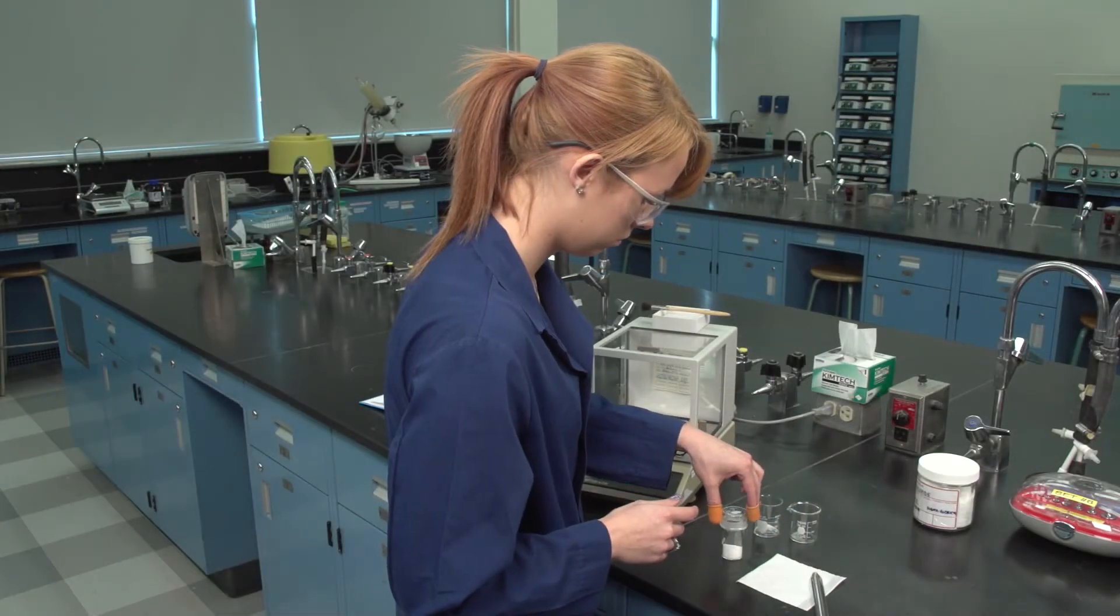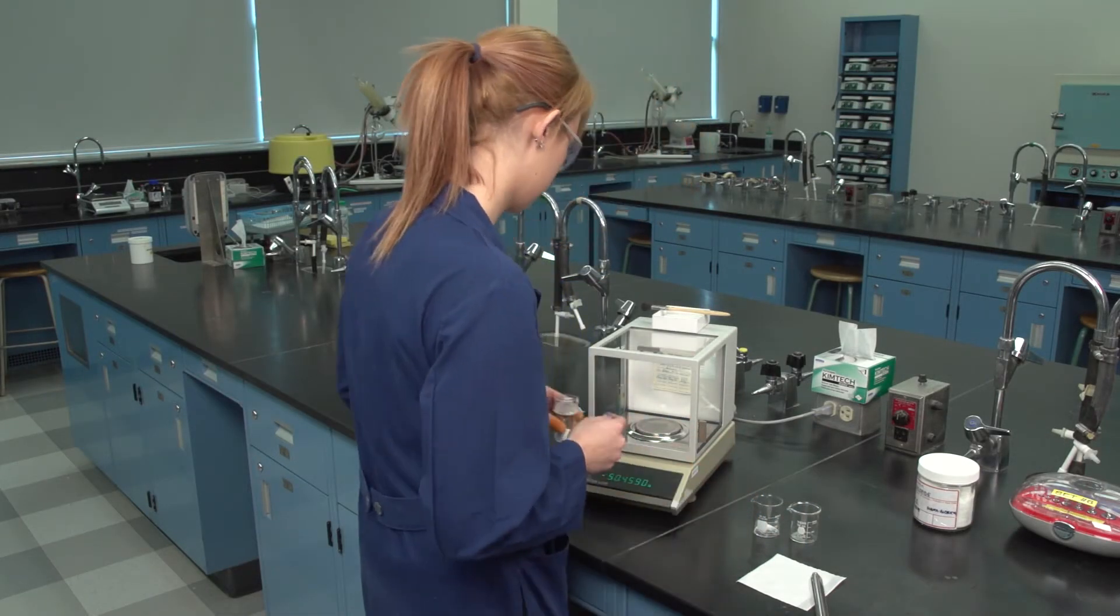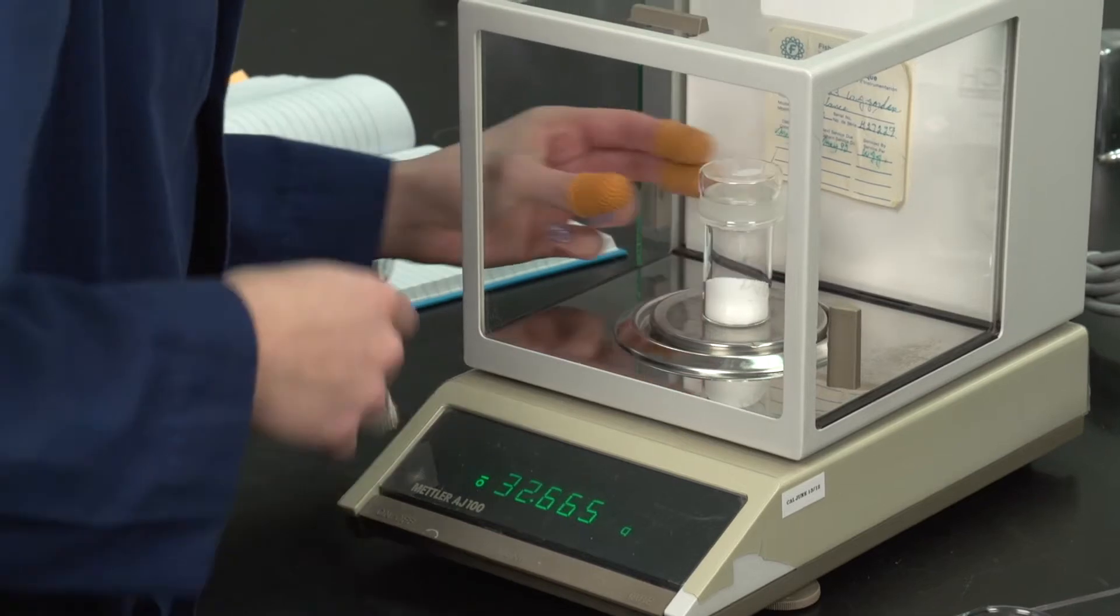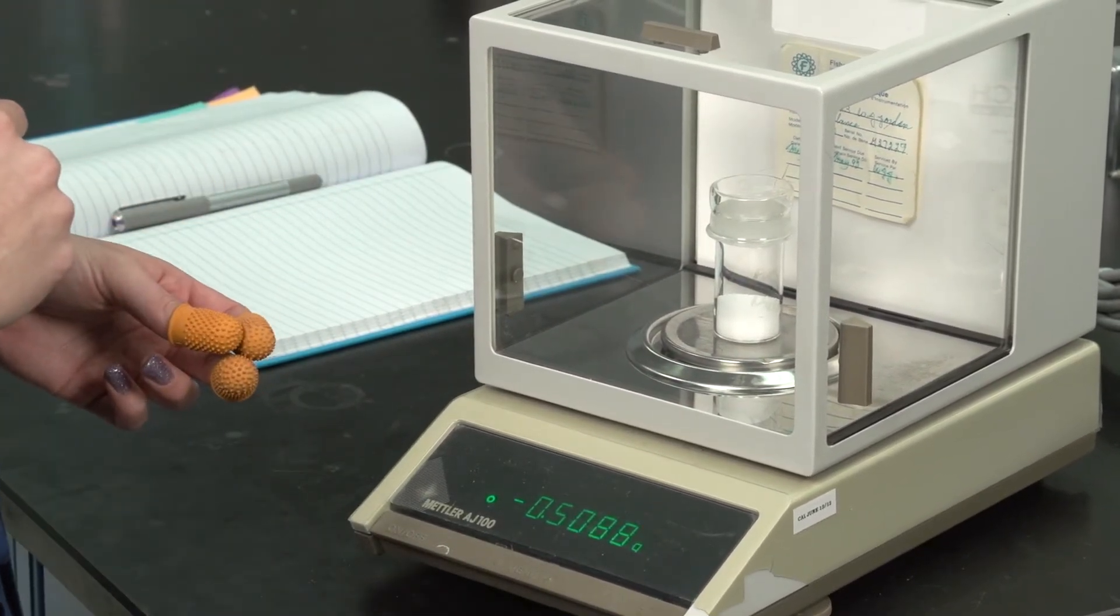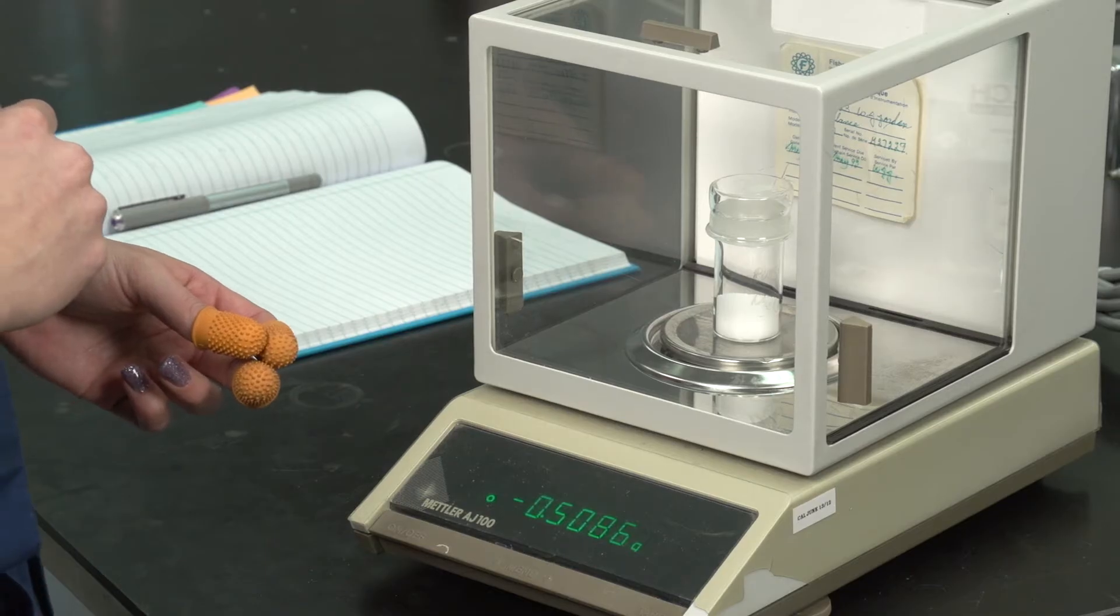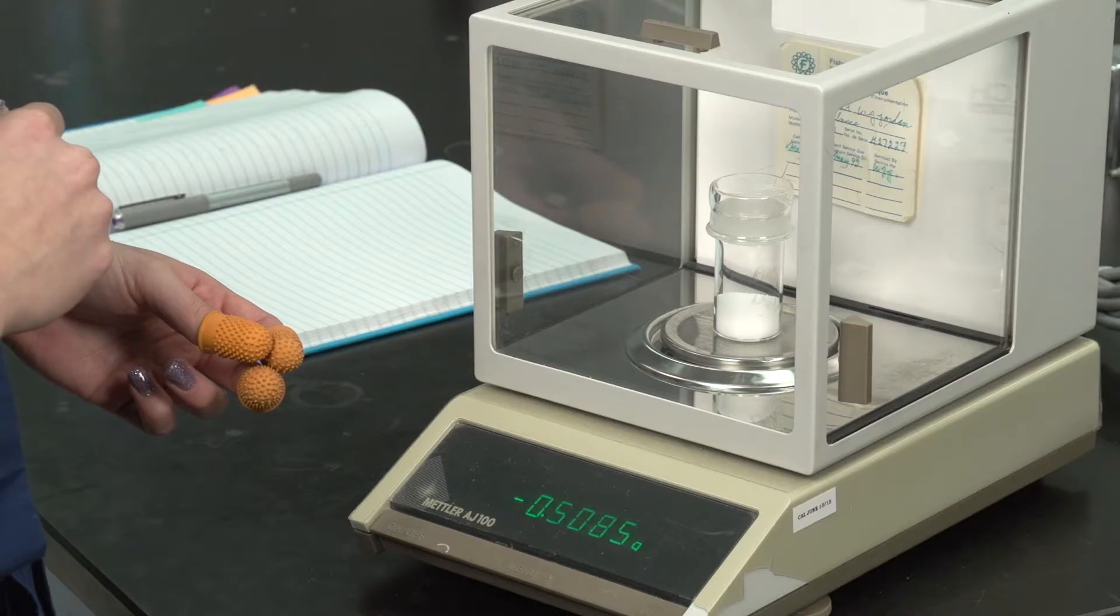Weighing by difference with tare is a method used when several duplicate masses of a material must be weighed out. The bulk sample mass is tared and the required sample removed. The result is a negative value on the balance.